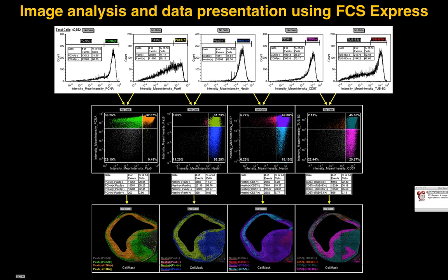So, for example, if we're looking at PAX6 PCNA positive cells, here they're color-coded in orange, you can see that they're basically patterned within the ventricular, subventricular zone of the telencephalon, and they're absent in the striatum and in the cortical plate, subplate, future regions of the pial surface of the telencephalon, which is extremely interesting.